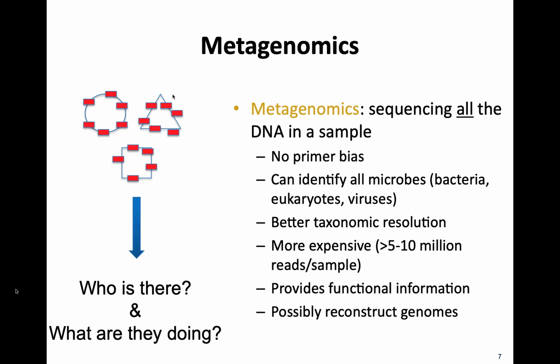If you look at the price of the kit for doing the selection and compare that to how much it would cost to do extra sequencing, it might not actually be that far off. The downside to doing the selection is you always have to worry about whether you're biasing your microbiome sample, whether you're selecting for microbes, but maybe particular microbes. So there is a bit of an issue.